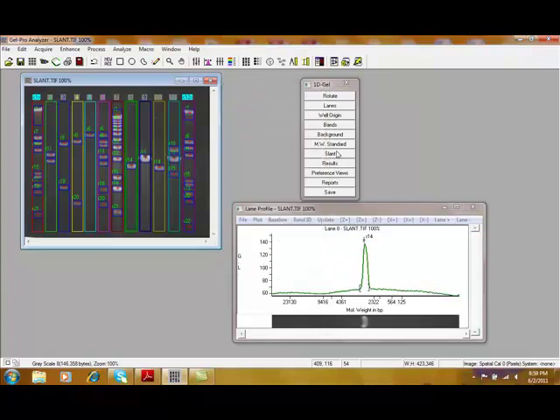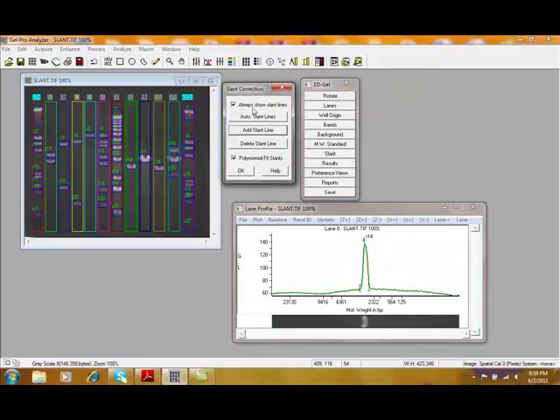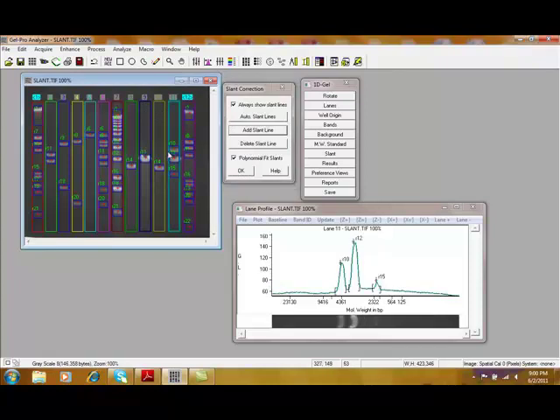From here, we can also correct for any types of slants in the gel. Right now, it's always showing slant lanes. You can detect them automatically. You can add and delete them. Right now, since everything is nice and straight, we don't need to correct for that. But if you do have any types of gel defects where the lanes have run in a curve pattern, you can correct for that.